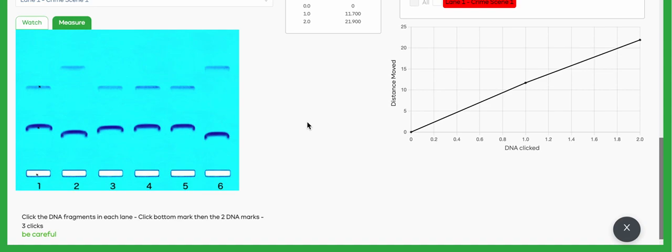See what results you get doing this gel electrophoresis lab, and remember each one of these marks is actually a DNA fragment that's moved, that you've measured, in this case coming from a crime scene.